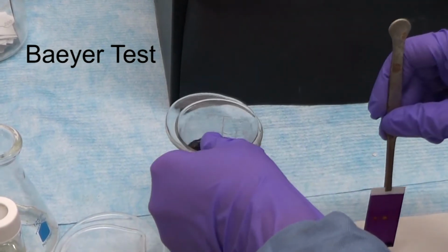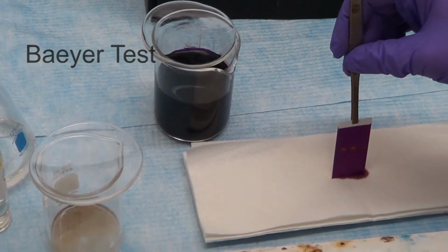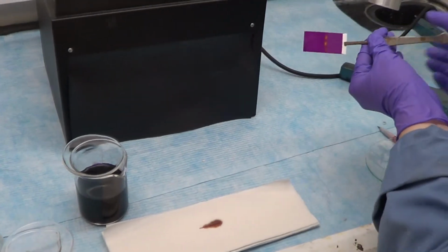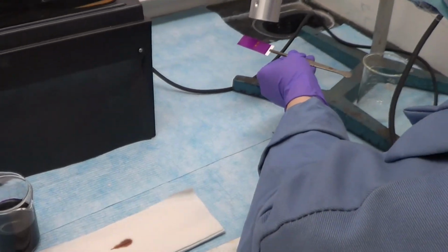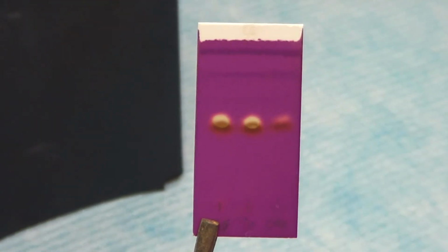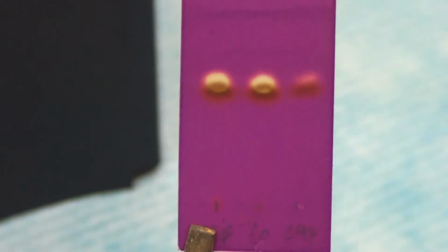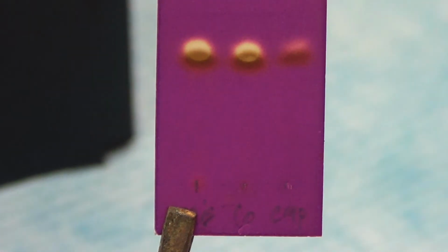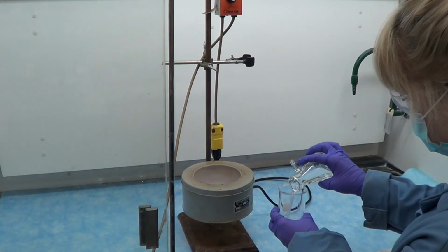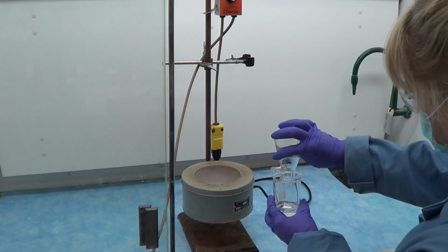For the Baeyer test, the TLC plate is dipped into a solution of potassium permanganate. The excess is dried on a paper towel, and the TLC plate is dried under a heat gun. Here are the results of the Baeyer test. You should be able to determine if the carvone stained or not. You should also be able to determine if the enantiomers also stain or can be differentiated by Baeyer test.